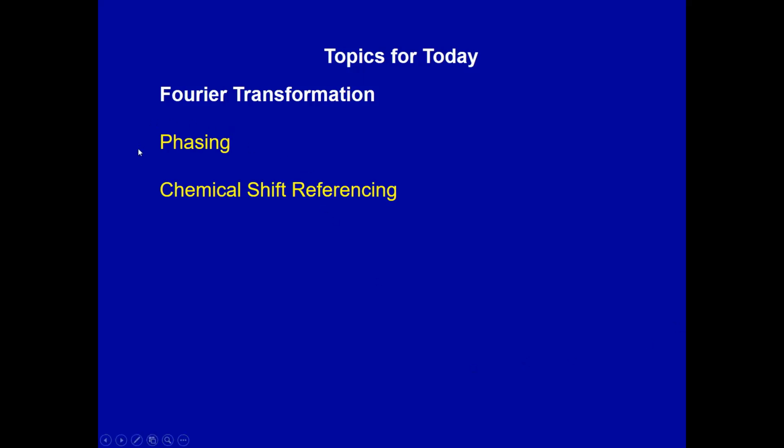A concept called phasing is generally thought of most often with MR spectroscopy, MRS, but it does have applications in imaging. Here today we will focus on the way that you would go about using phasing for spectroscopic studies. And the last term is related primarily to MR spectroscopy again, chemical shift referencing. Professor de Graaf has discussed this previously. We will discuss it again today.